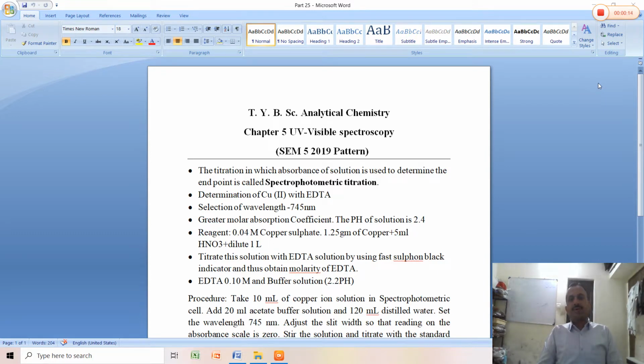Now here there are a number of applications associated with the UV visible spectrophotometer. The colorimeter also has different applications for different chemicals and different determinations of concentrations. The colorimeter is used to measure the colored intensity of concentrated solutions. The concentration is nothing but the amount of substance present in the solution.